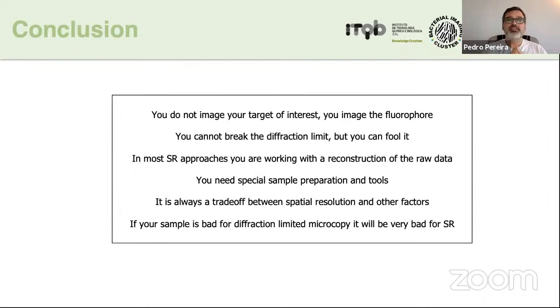Just let me leave you with some food for thought and some conclusions. I mentioned a few of these throughout the talk, but when you decide, I want to do super resolution, I really want to, I love super resolution, I really need it, it's my dream and so forth, you have to think that it's a hell of a lot of work to get a true meaningful result, okay? Despite the fact that they're getting easier and easier, you still have to think about what you're doing.